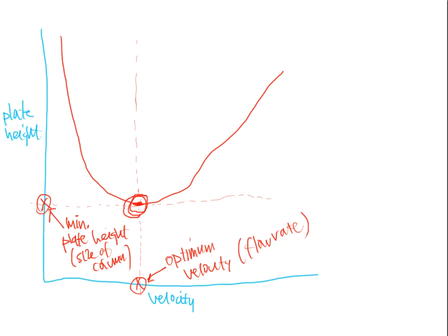Okay? All right. So we're almost finished with chromatography now. We know the Van Deemter equation, and just a few more comments that I want to make on chromatography before we close this section and this module out.